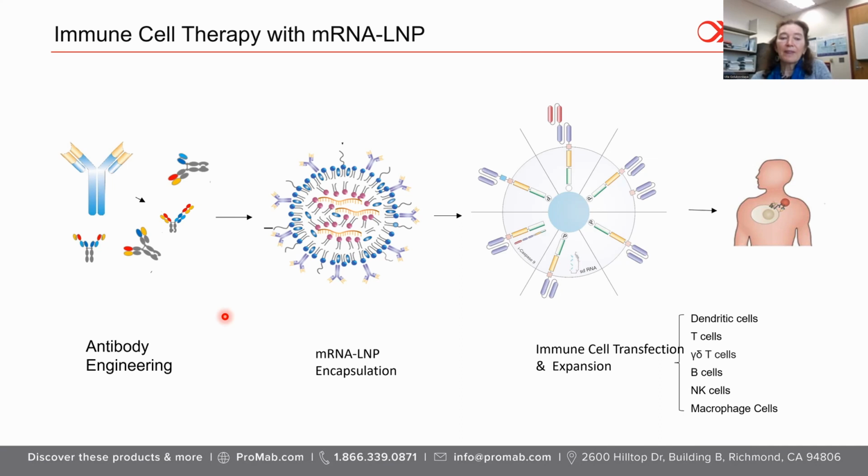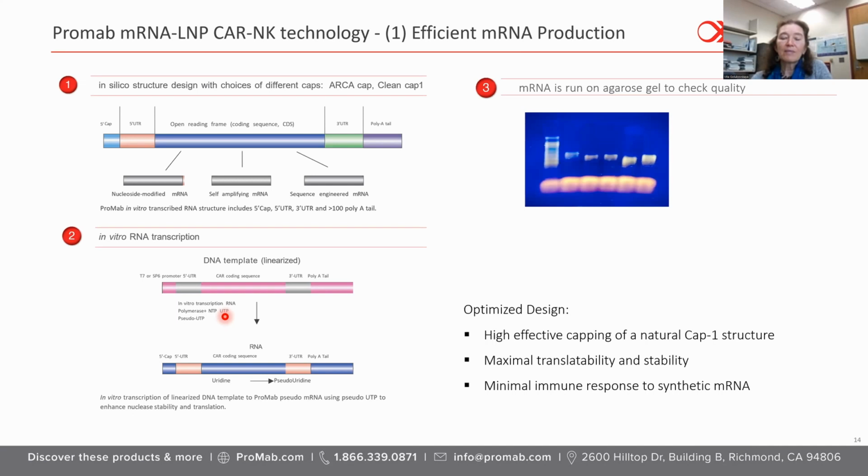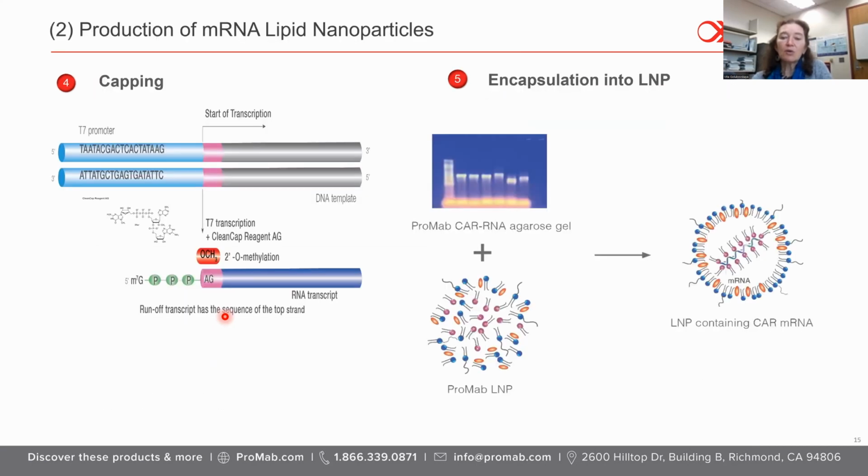So yeah, I think it's a very nice presentation, and it's amazing that you can start from the synthesis of the gene material up to the end product, the LNP delivered to the cells or even the animal models. Yes, we already did in mice, injected proteins, and we created antibodies against spike protein. So these nanoparticles are very good for use in vivo, and we also did a toxicology study. I did not show slides, but there was no toxicity with the nanoparticles generated.